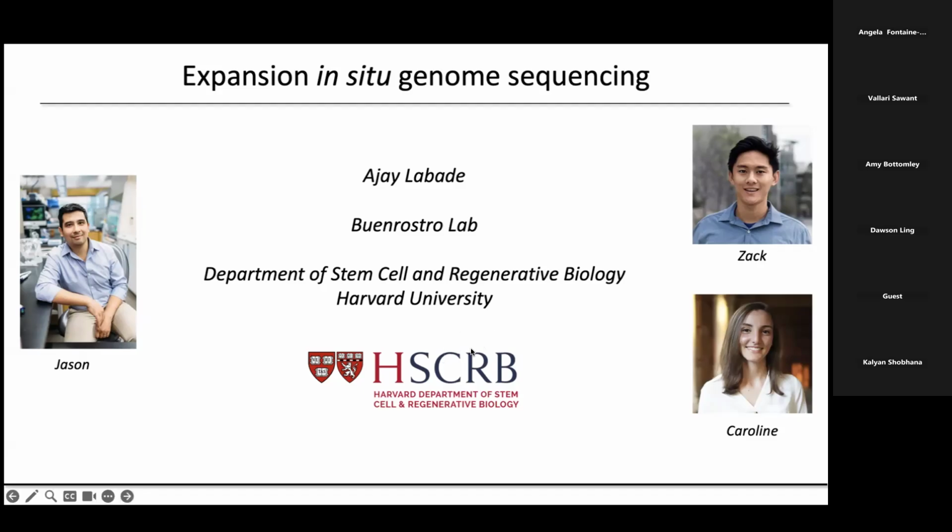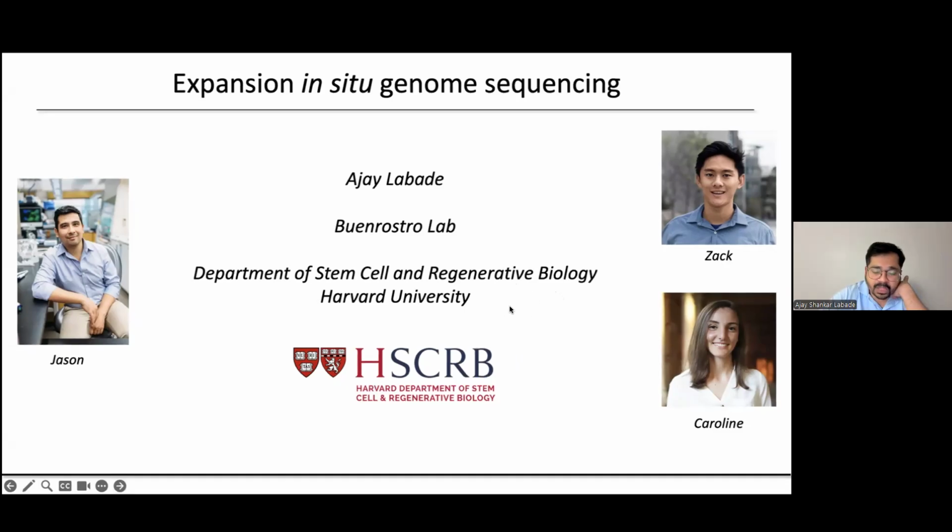Hopefully at the end of my talk, I'm going to leave you with a really new perspective of looking at the genome at extremely high resolution, and also of looking at the DNA sequences interacting with proteins inside the nucleus. But to begin with, I want to ask: why in situ genome sequencing? Why do we want to sequence the genome inside the nucleus, inside an intact cell, at extremely high resolution?